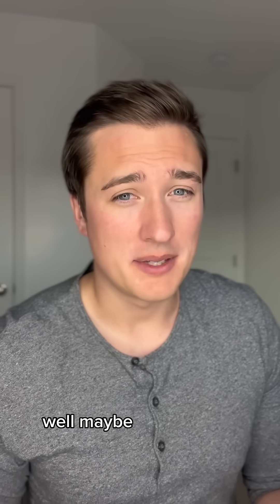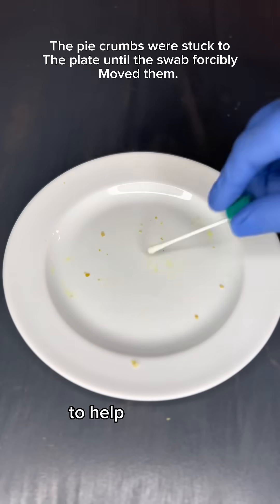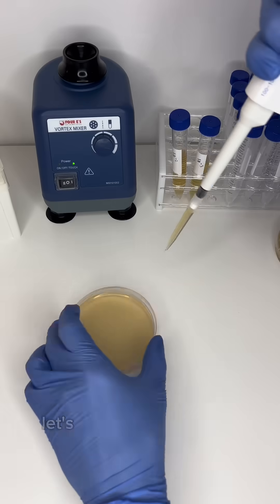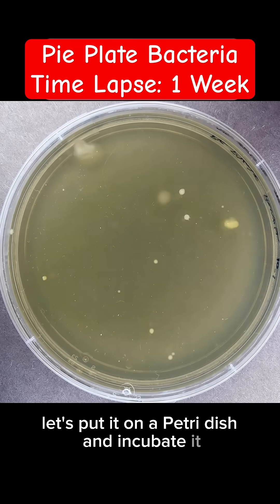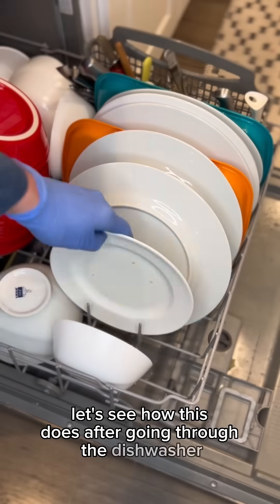Well maybe, but I'll show you just in case. Let's use what's called an environmental swab to help determine how much bacteria is on this plate. Let's put it on a petri dish and incubate it. Okay, so there is lots of bacteria. Let's see how this does after going through the dishwasher.